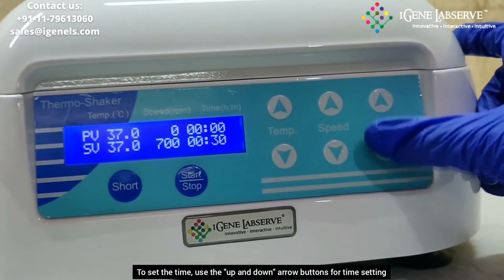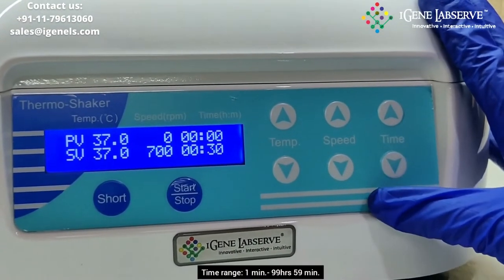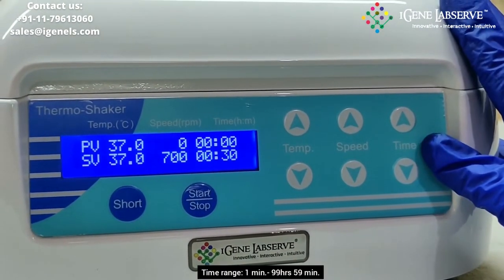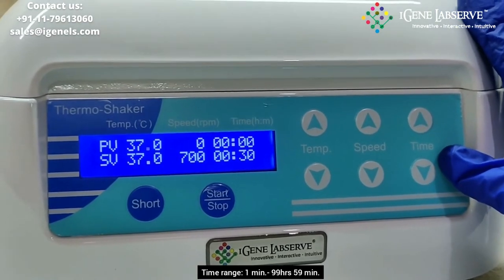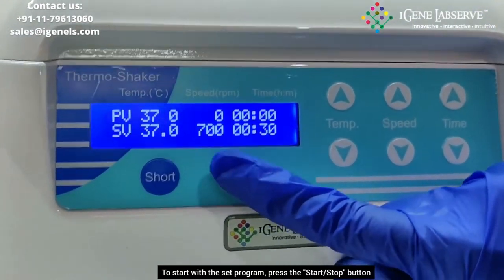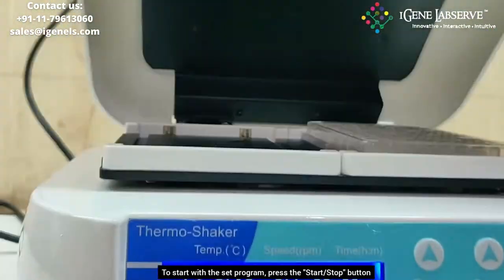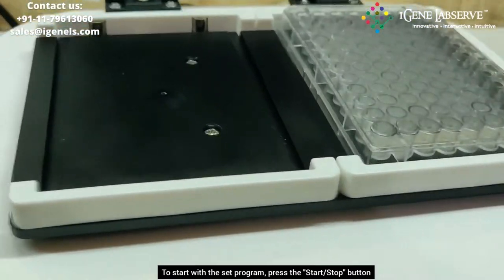To set the time, you have to use these 2 up and down arrow keys. The time ranges from 1 minute to 99 hours and 59 minutes. To start the shaking, you have to press the start and stop button once, and it begins to shake.